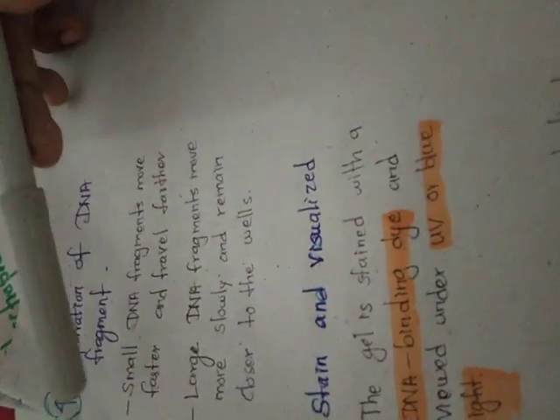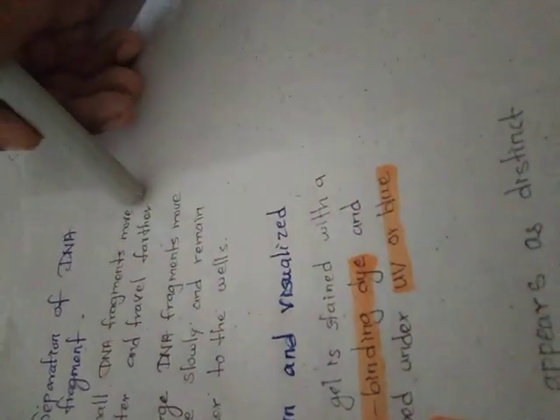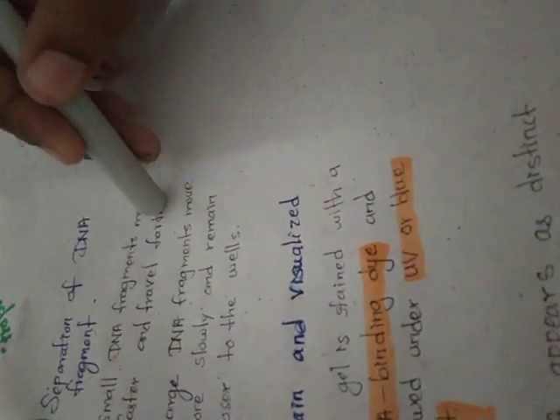The fourth step is separation of DNA fragments. Small DNA fragments move faster and travel far. When we apply the electric current, the DNA fragments are moving. How do they move?